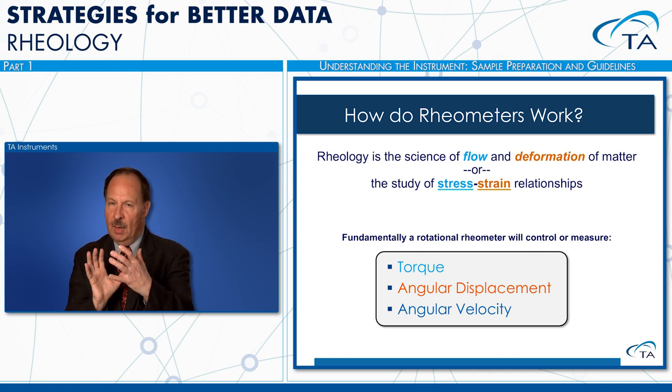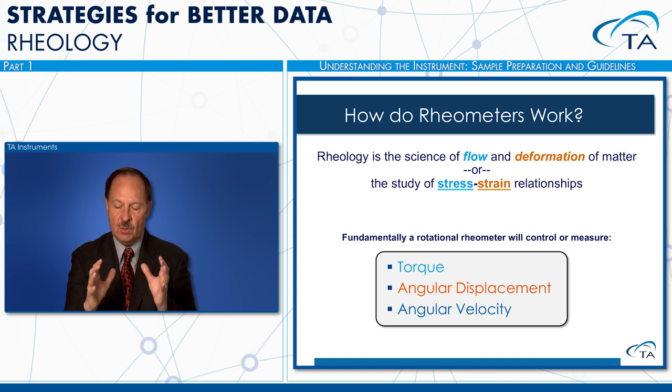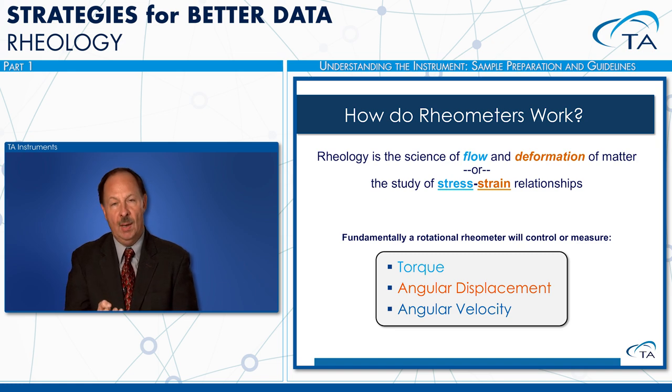So torque, since this is a rotational rheometer, is the counterpart to force. This is simply force times distance, and since it's rotational rheometry, we're interested in the torque. How high can we go? How low can we go and still get good, sensitive measurements?